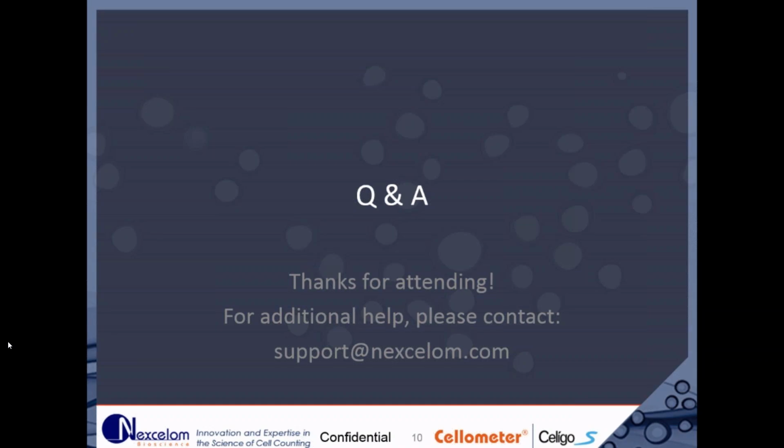Thanks, Sarah. Next question states, which well do you use to set up the exposure time? Okay, so the exposure time for your Hoechst channel can be any one of the wells because they all are stained equally with Hoechst. But for your secondary antibody, I would set up something that you know has the positive signal, the positive cell line. Use that as your well for your channel setup for illumination and focus for your secondary antibody staining.